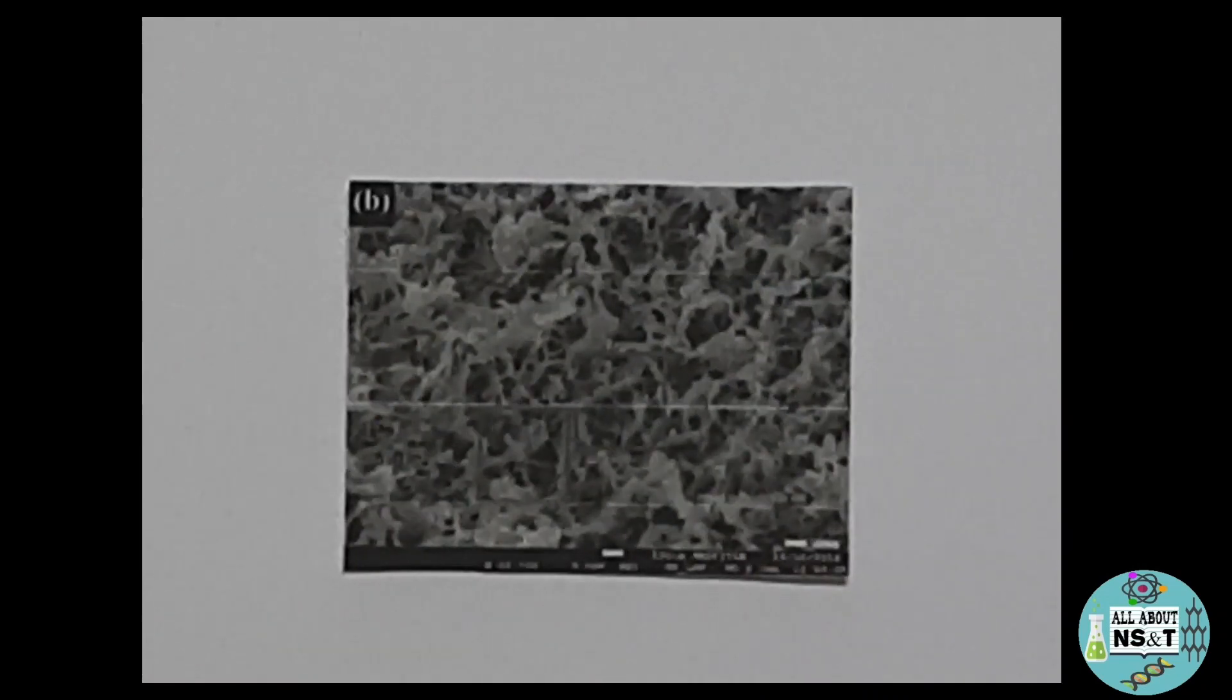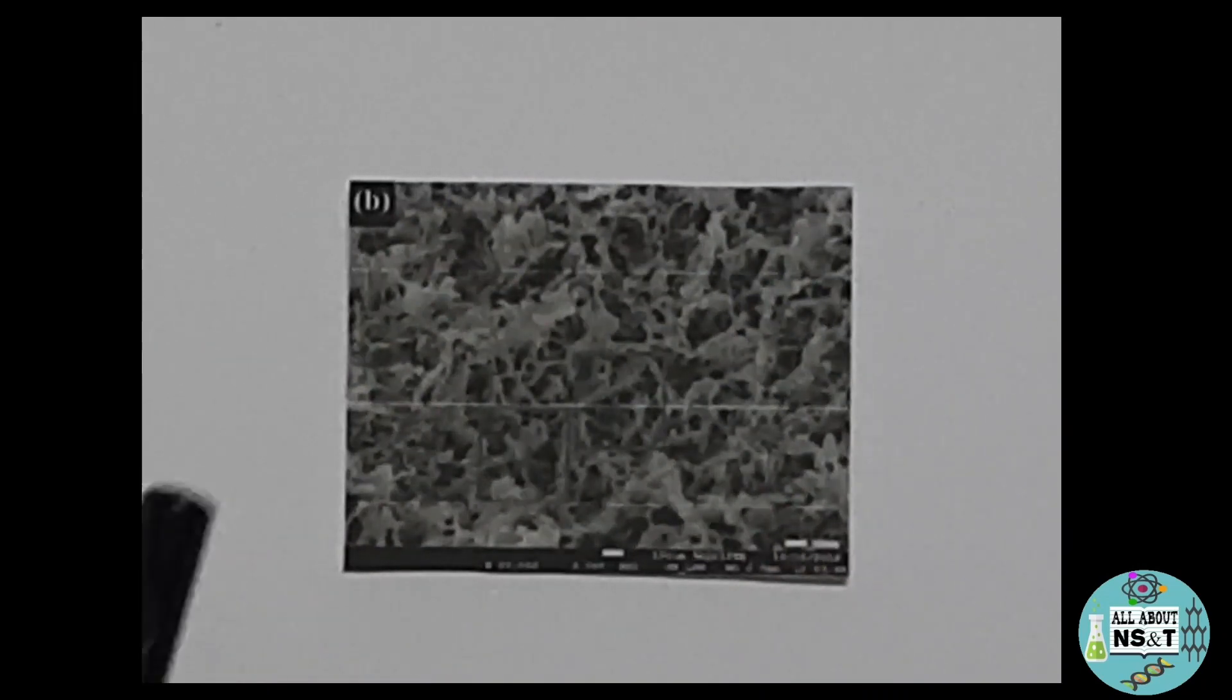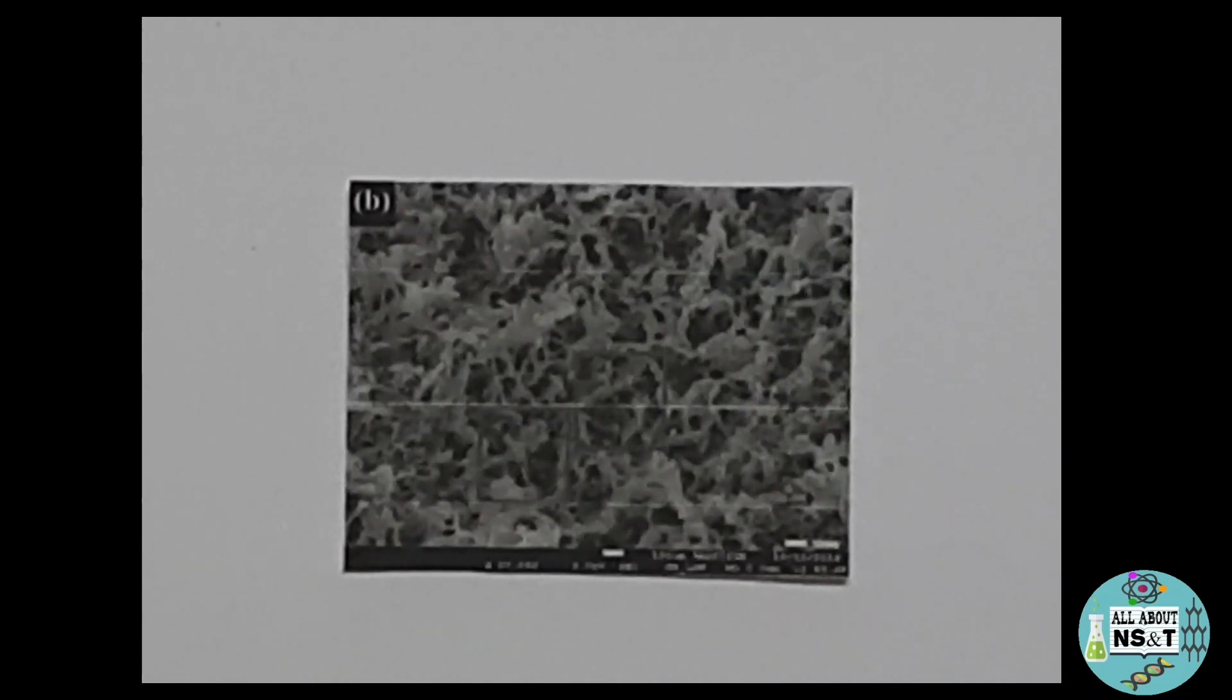So for reference, you can see this is the SEM image of carbon nanotubes. So this is how carbon nanotubes appear under scanning electron microscope. However, SEM images are black and white because they are created without light waves. So that's why SEM images appear black and white.